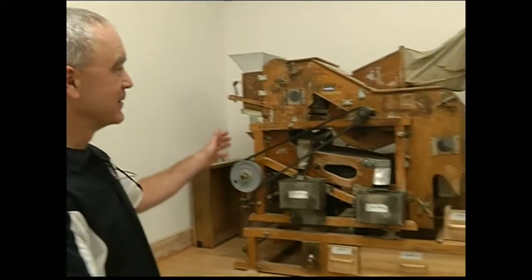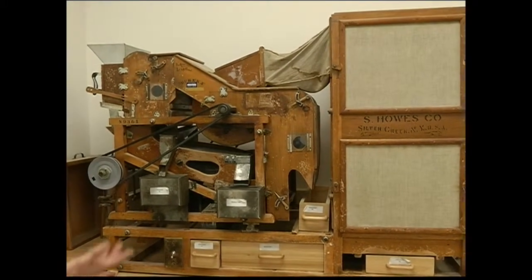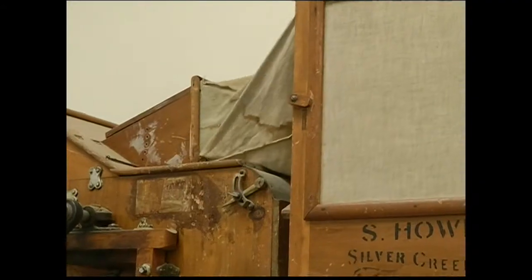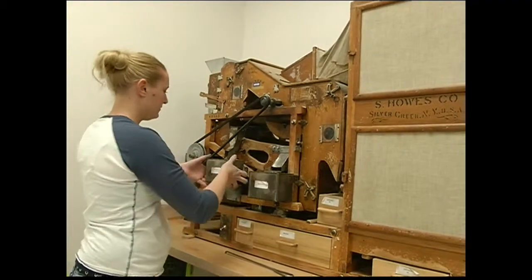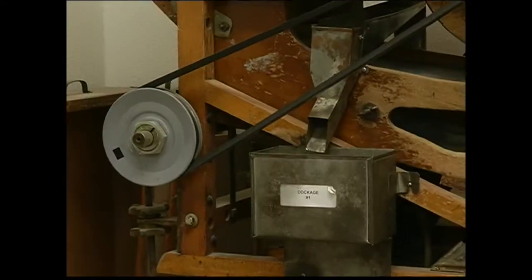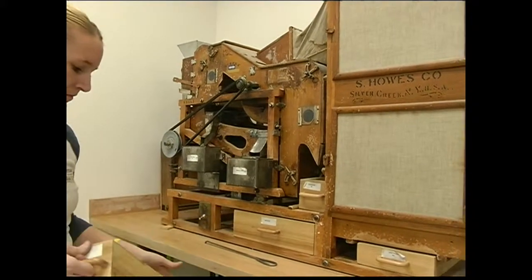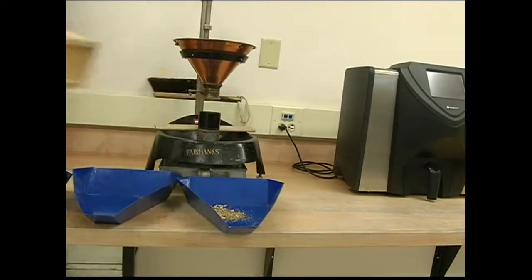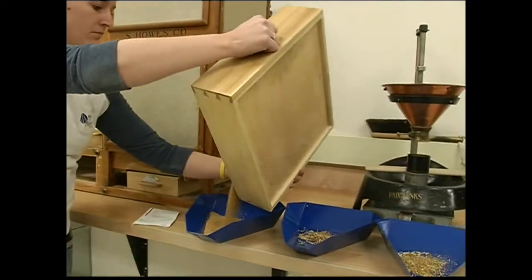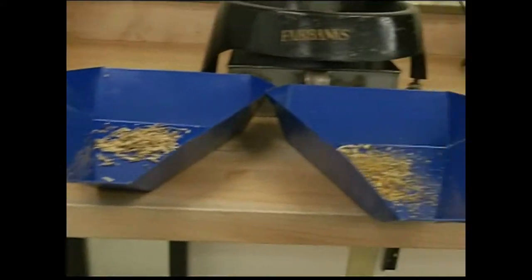People ask about this old machine that sits back on the back counter, and they say, well, is that an antique? And so the non-sarcastic answer is yes, it is an antique, but we use it every day. We use this for processing mustard samples, and we literally process hundreds and hundreds of mustard samples every year. There is a group here right in Great Falls that is brokering mustard throughout Montana and up into Canada, and all those farmer samples come here and we analyze the quality of those mustard samples. This machine was actually bought in around 1946. We paid $157 for it. We have tried to replace this, and this company, they're actually still in business. But the machines they make nowadays are the size of a building.